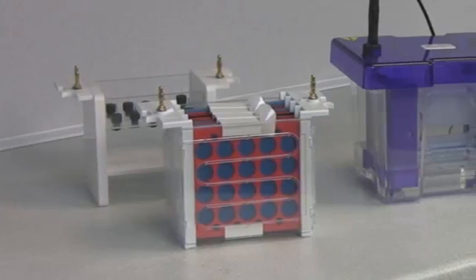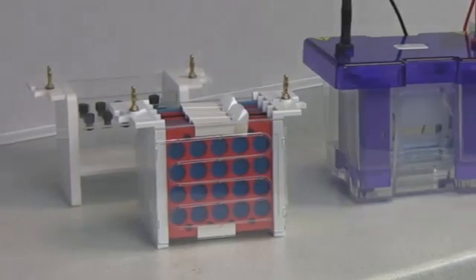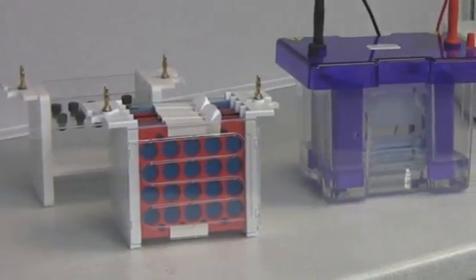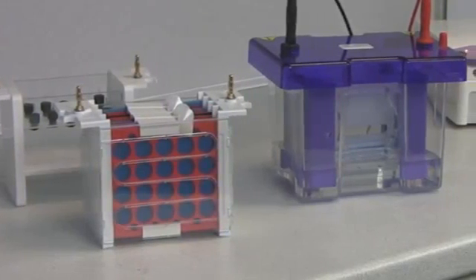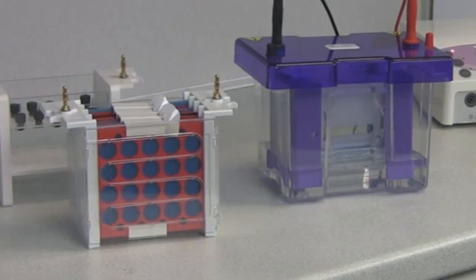Interchangeable modular inserts for isoelectric focusing and electroblotting allow the user to switch quickly and easily from one electrophoresis technique to another.